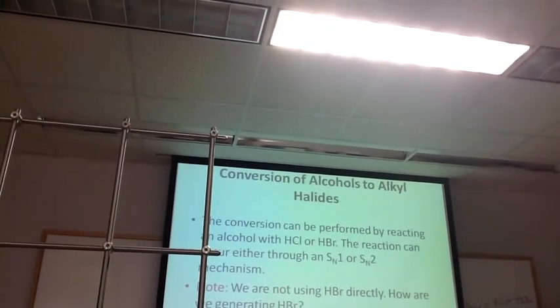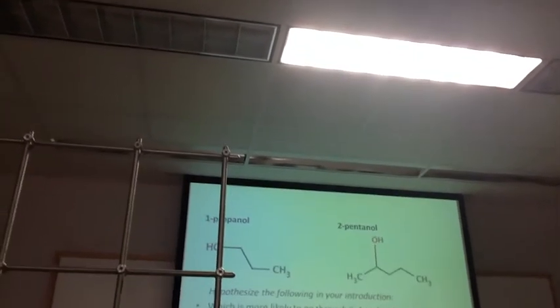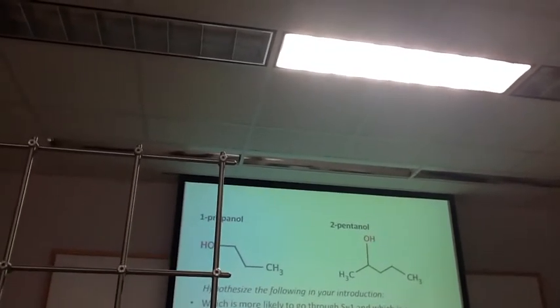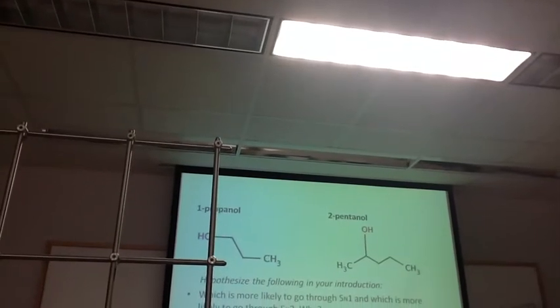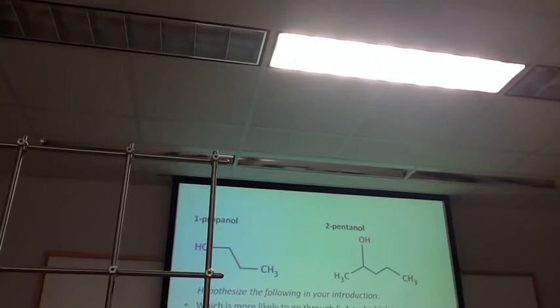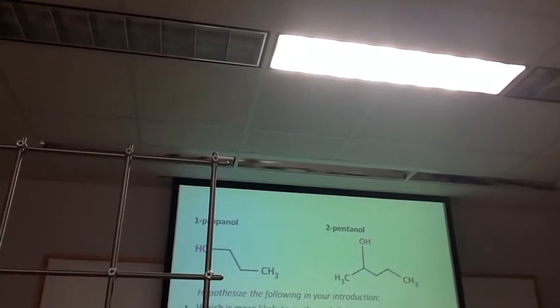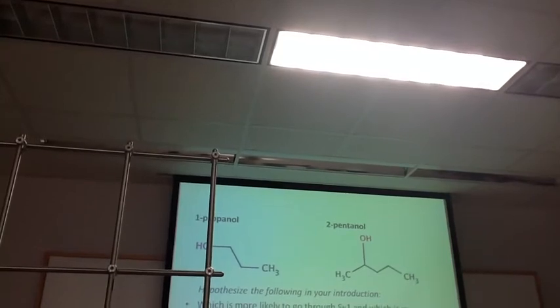And I know I shouldn't have to say this, but I'm going to say it anyway. If we're dealing with strong acid, please be careful. Don't burn yourself. If you do get something on you, you can come blot it off with a paper towel, and then you can wash it. If there's any left on it, you can wash it with some base, or just wash it under lots of water. Or if you just freak out and come get me or Sonia, we'll help you out too. Okay. All right. So, questions now.